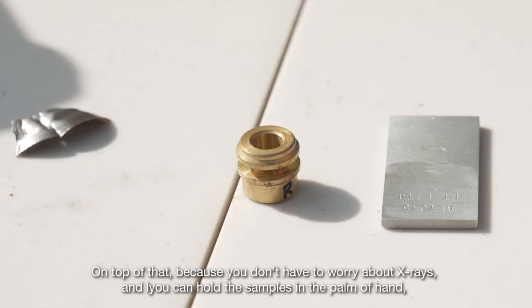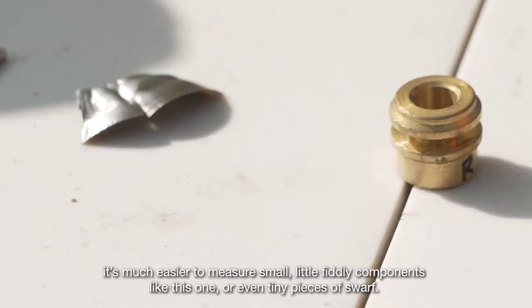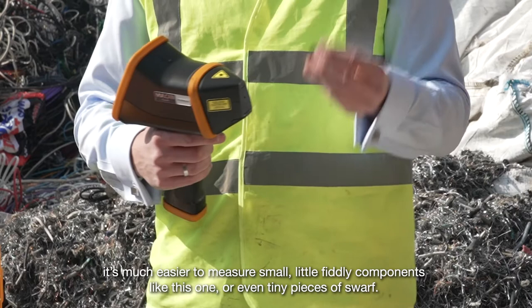On top of that, because you don't have to worry about x-rays and you can hold the samples in the palm of your hand, it's much easier to measure small, fiddly components like this one, or even tiny pieces of swarf.